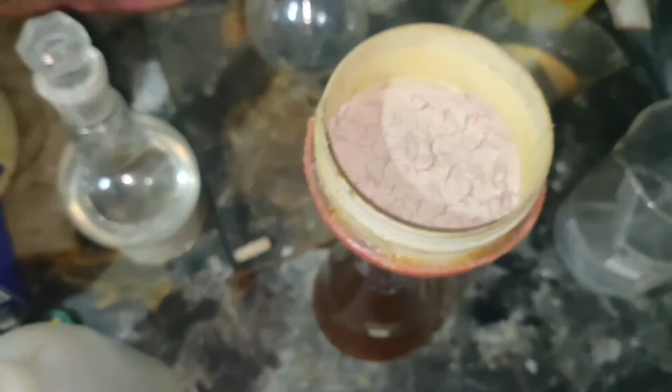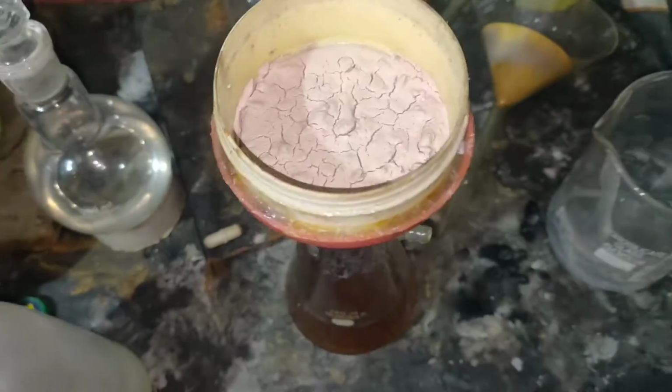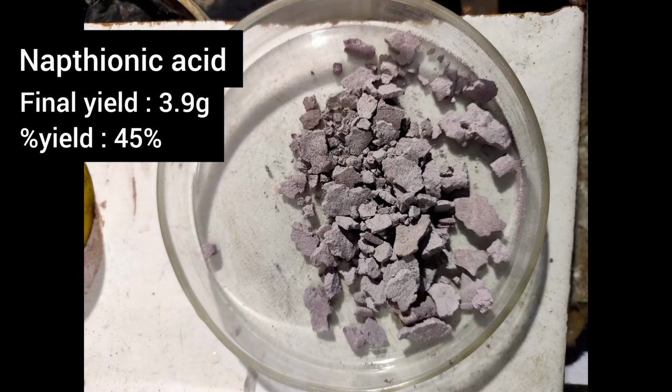The precipitate was washed with a copious amount of distilled water so as to remove any soluble salts and 1-amino naphthalene-2,4-disulfonic acid. After drying, the compound looks similar to the naphthionic acid prepared by Magpie. The final yield of naphthionic acid was 3.9 grams, which corresponds to a percent yield of 45%.